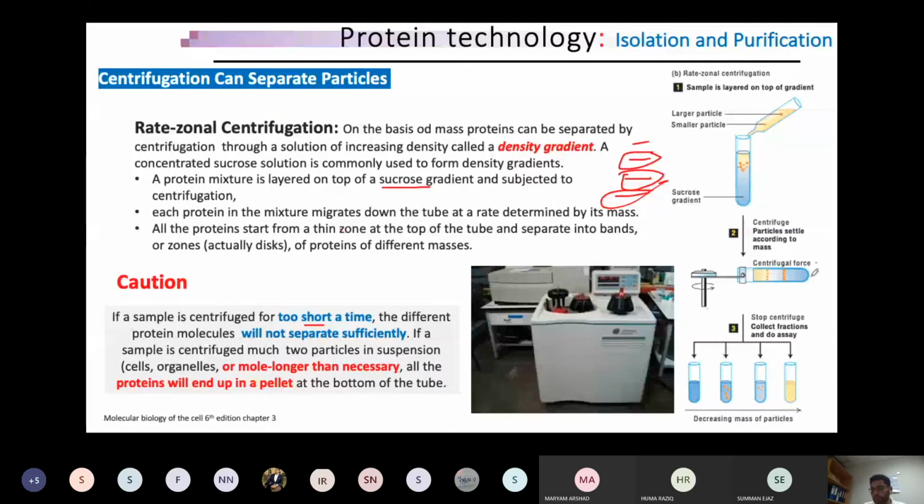It could be possible everything will be pelleted. So that means the longer you put pressure on this smaller molecule, which is under my cursor at this time, this one, if you even put the pressure for a longer period of time, even this could be settled down. You see, this is a very important point.